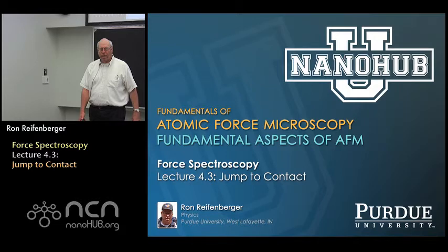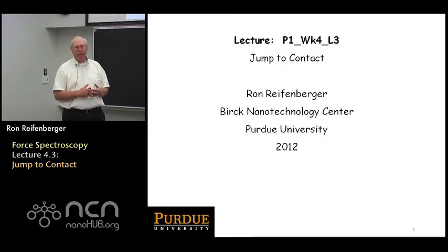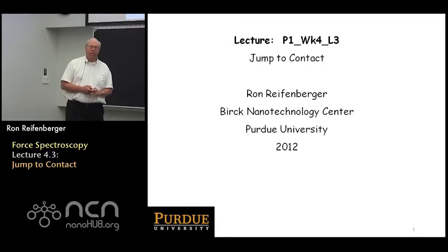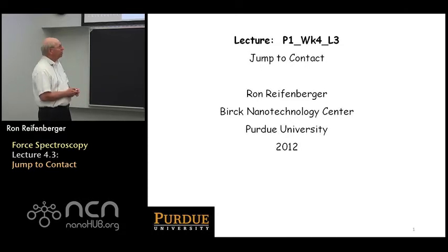nanoHUB-U, online instruction. Hi, we're back, and we're going to continue to discuss this jump to contact phenomenon and try to better understand what implications the snap to contact of the tip to the substrate might have for understanding experimental data.